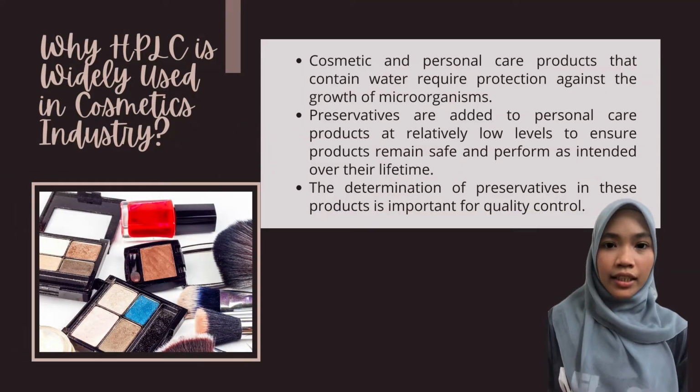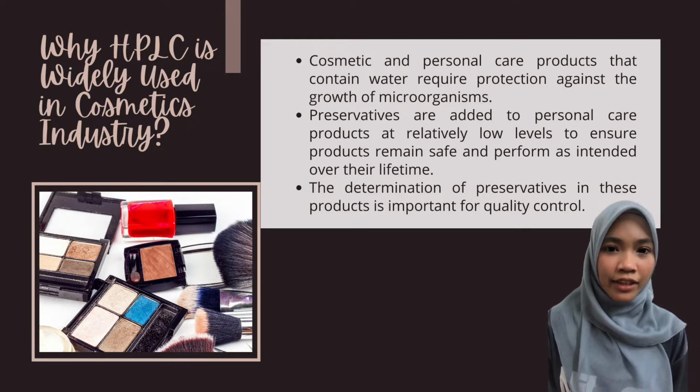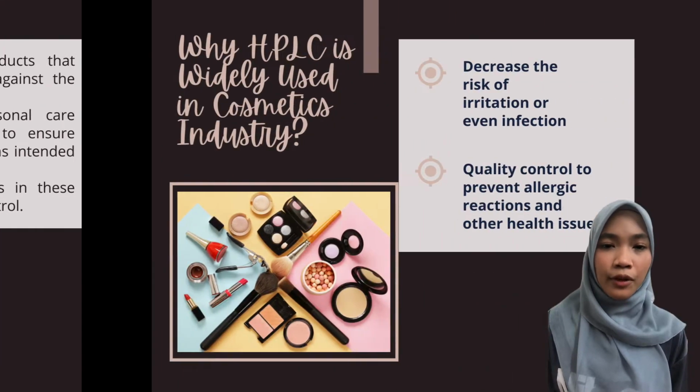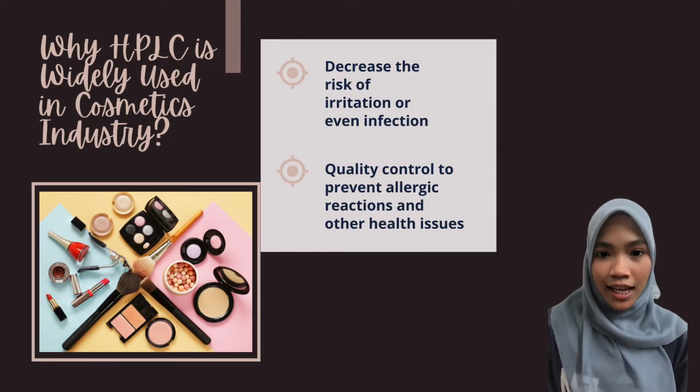Preservatives are added to personal care products at relatively low levels to ensure products remain safe and perform as intended over their lifetime. The determination of preservatives in this product is important for quality control to prevent allergic reaction and other health issues.